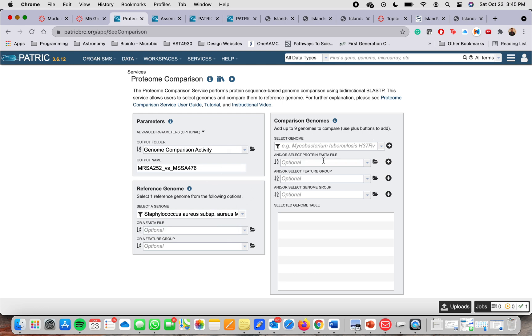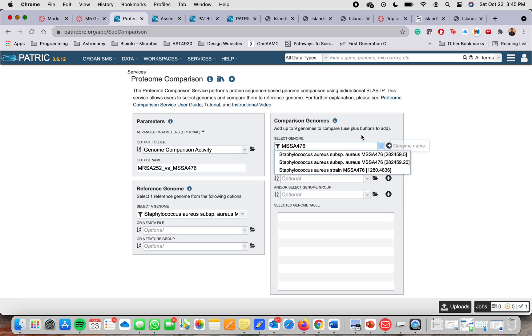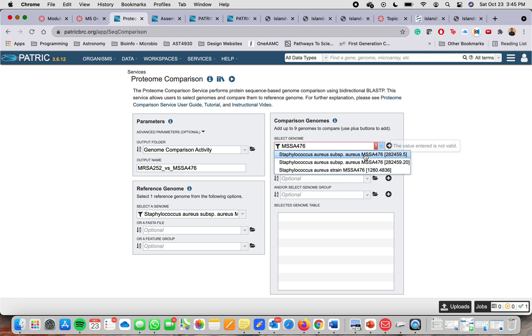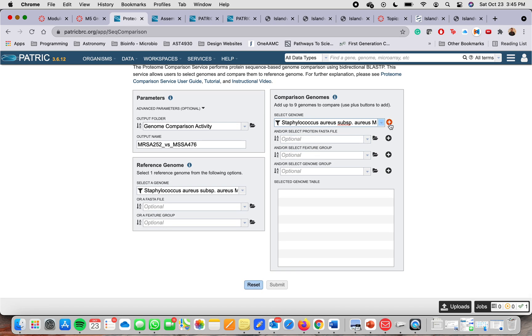So now in the comparison genome window, you have to specify the organism that you want to use to compare. So in our case, it's MSSA 476 and you're going to click here. And the first one, we have three different ones. I use the first one. And then, so you have the same options here. You can use the protein sequence in the FASTA format or two different options. Once you enter the name, you need to make sure that you click on the plus sign. So it is added here.